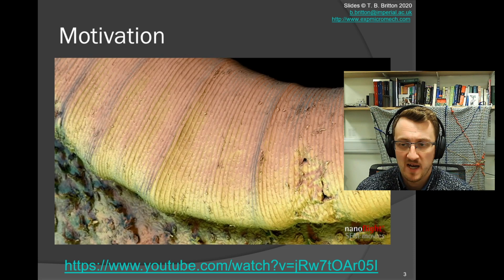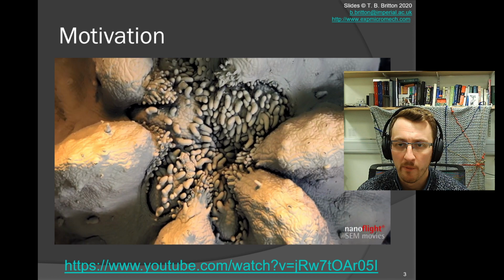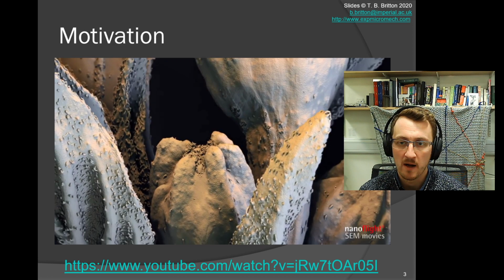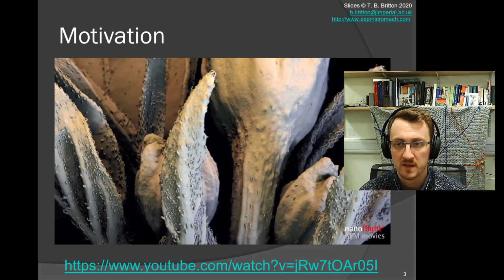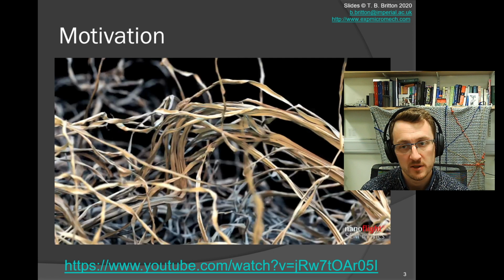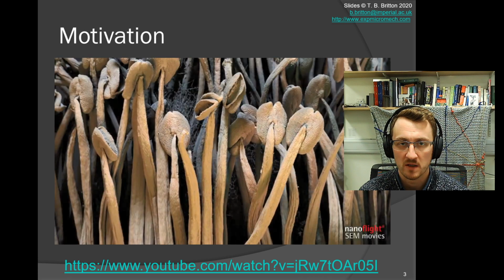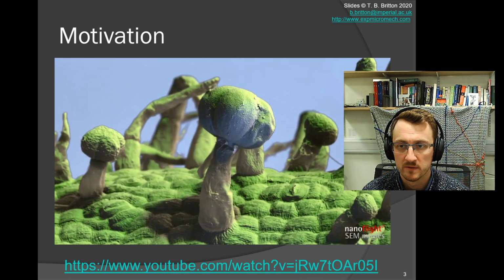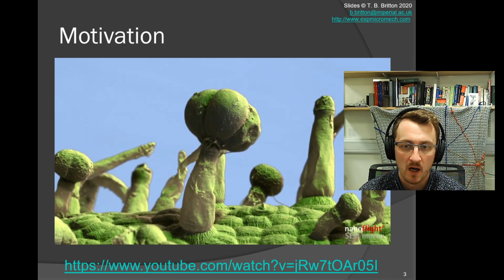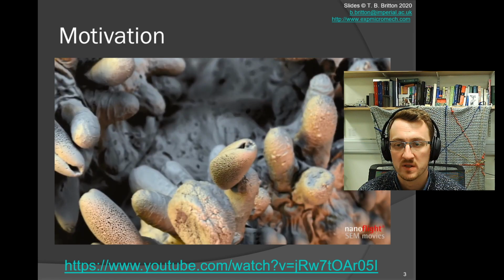These are fantastic videos to highlight the opportunity afforded by the scanning electron microscope, where we can see a huge range of depth information, and we can start to piece together stories about the objects that we're characterizing. What we have to remember is that every single pixel within this image is information, and we'll see why that's important as we characterize the information we're collecting associated with the electron-matter interactions themselves. This enables a whole range of different samples to be inserted, observed, characterized, understood, and to tell stories about the materials that we're interested in.